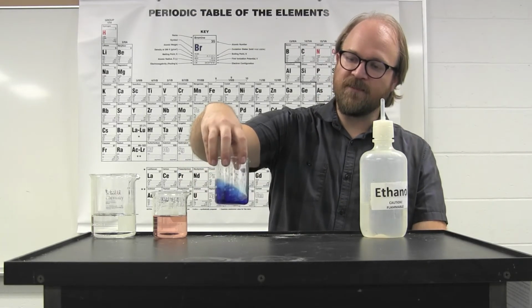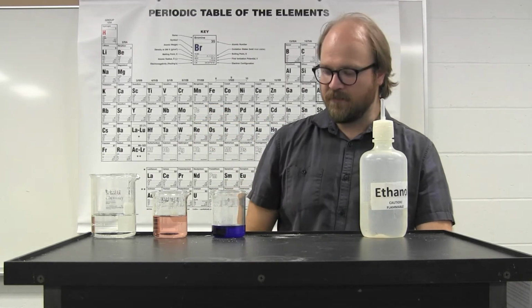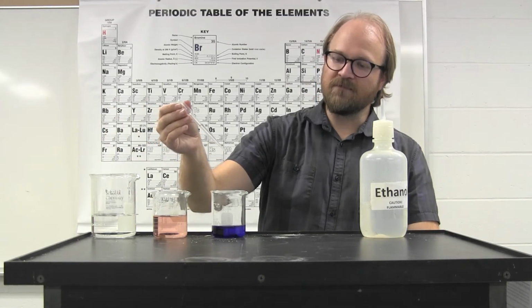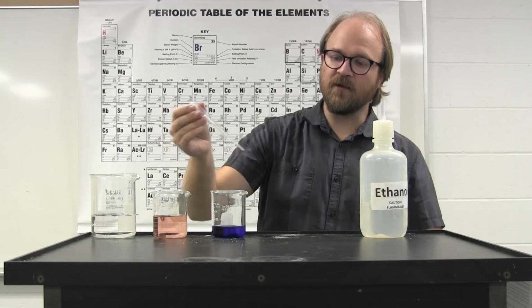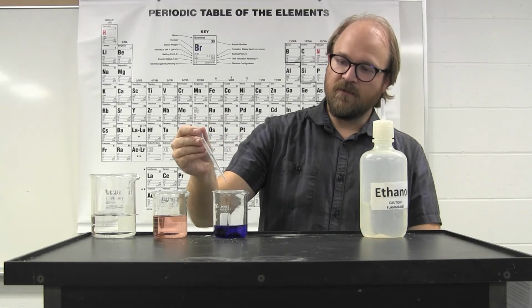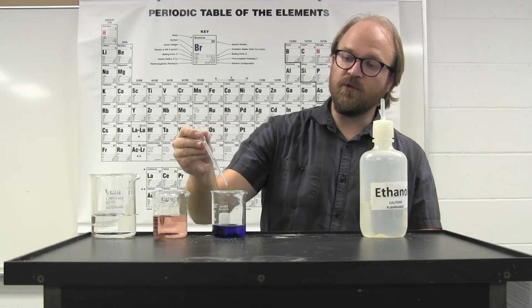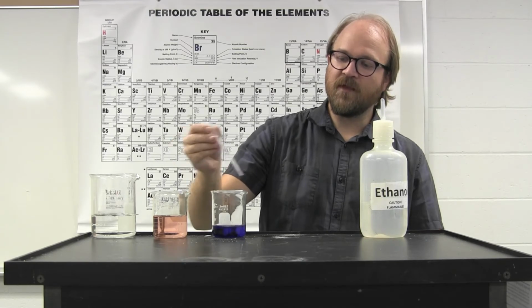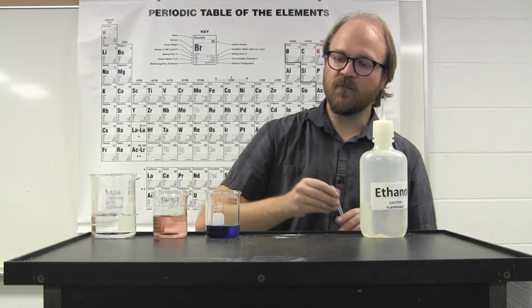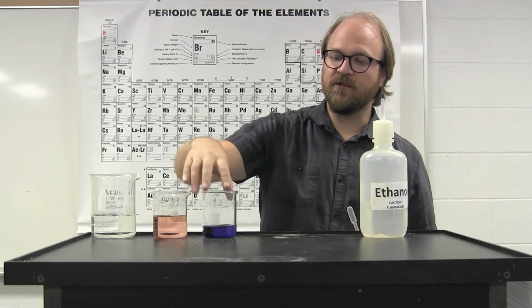By starting with the blue solution of the cobalt tetrachloride complex and adding a very small but known amount of water, the color of the overall solution is a blend. The solution color is a mixture of the blue cobalt tetrachloride and the red cobalt hexaaquo color. The result is more of a purple solution.